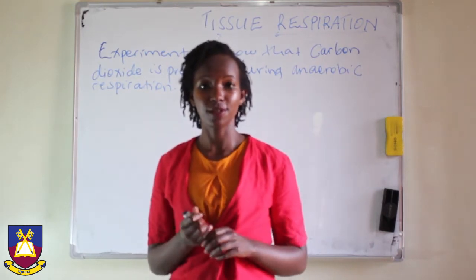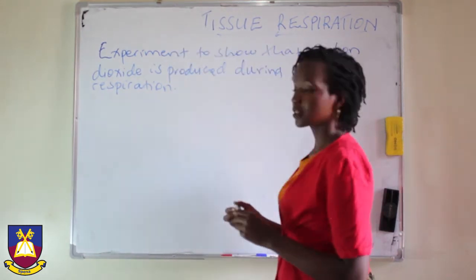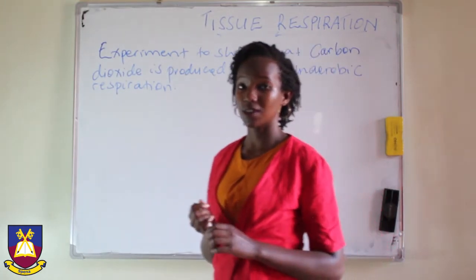during respiration of yeast. And so, we're going to start right away with the materials that we shall need.